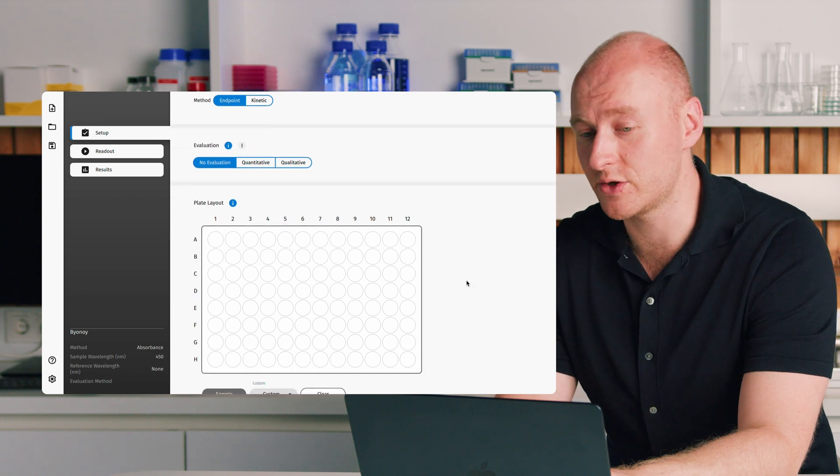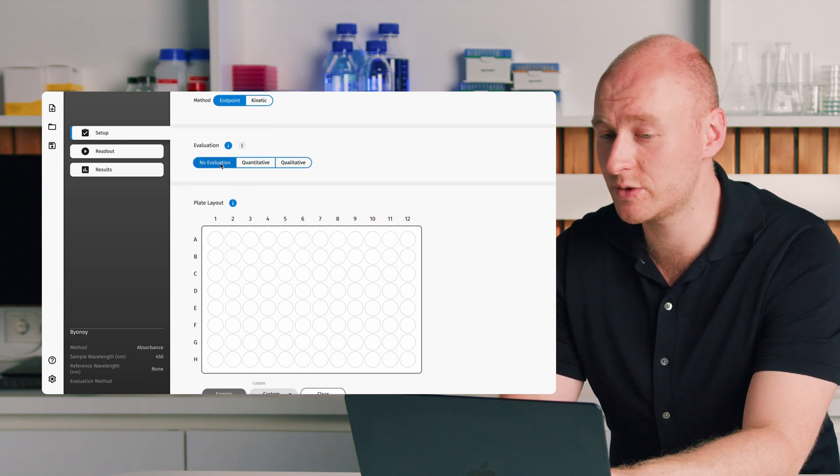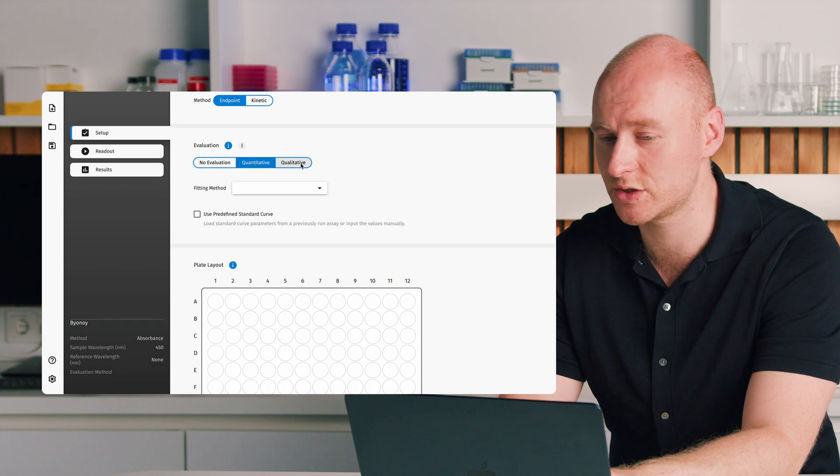We can then move on to our evaluation. We have no evaluation, quantitative evaluation, and qualitative evaluation. No evaluation is our version of read only — no calculations are performed. This is for when you want to read samples and export the data to do analysis in Excel or other software.